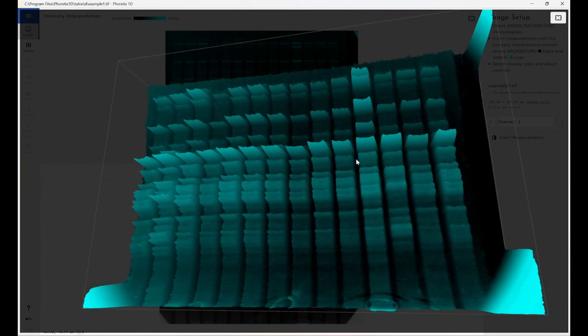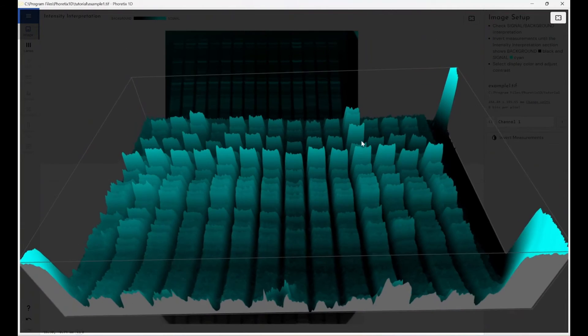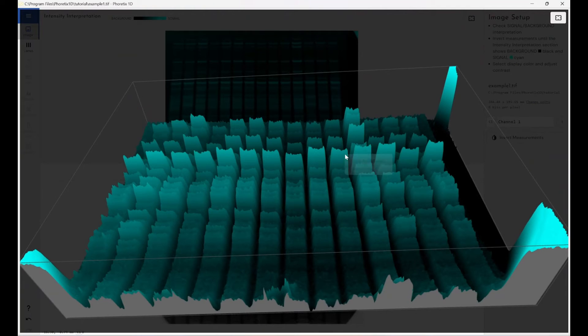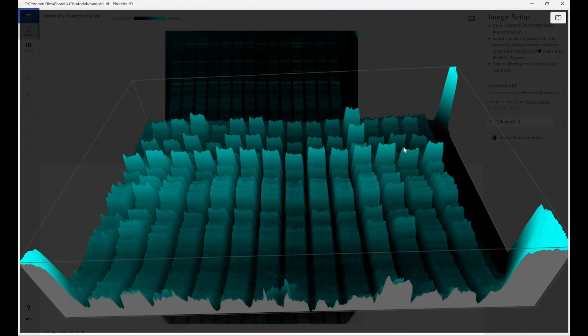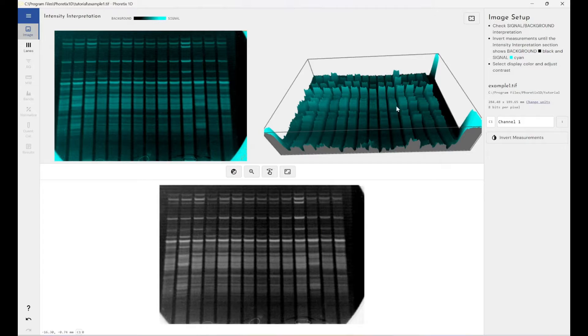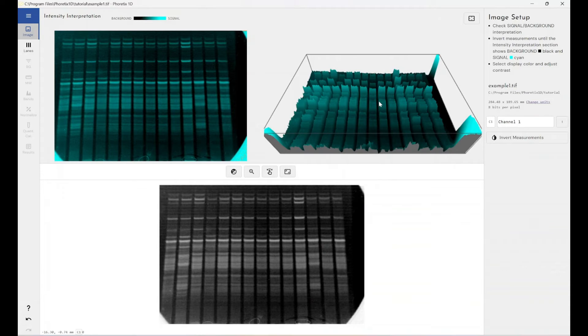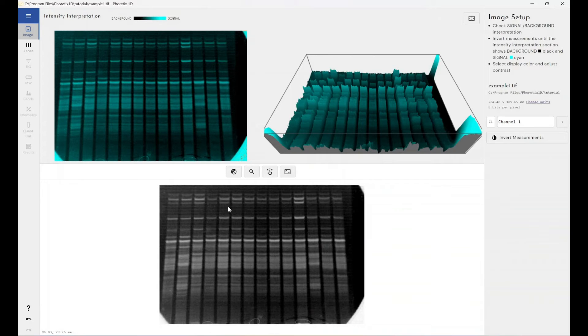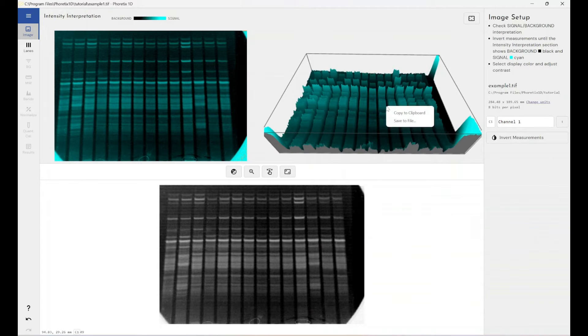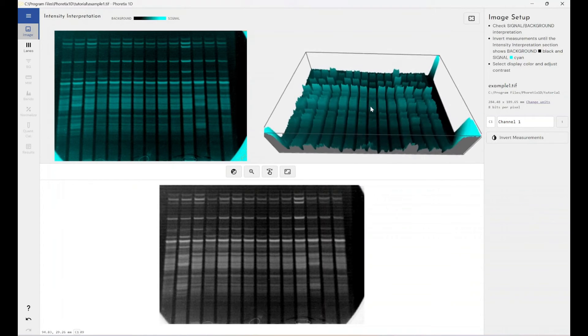And obviously from any of these sections, we can right click and copy to clipboard or save to file so you can get your publication quality images straight from the software. Again, that would be a great teaching moment for students to be able to export all of these different sections onto a paper or a poster presentation as part of their studies.